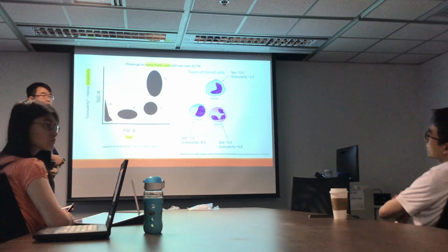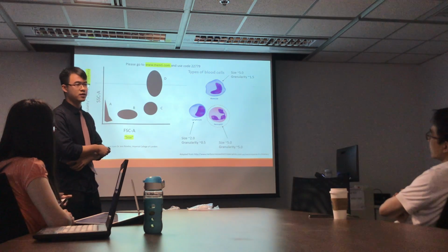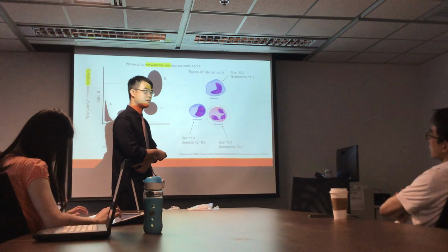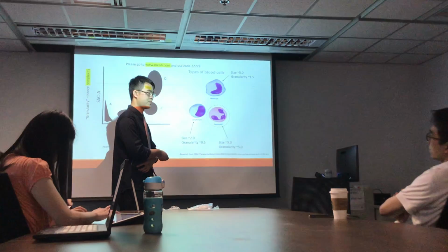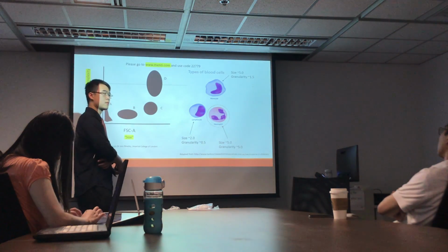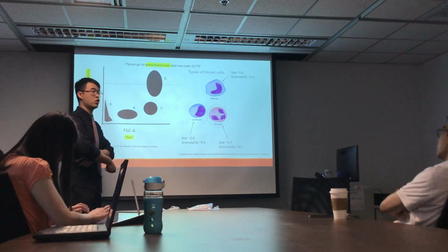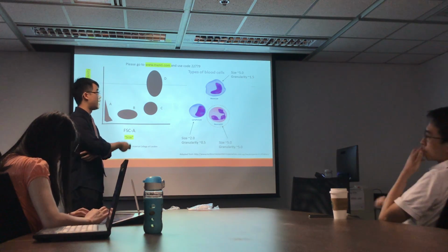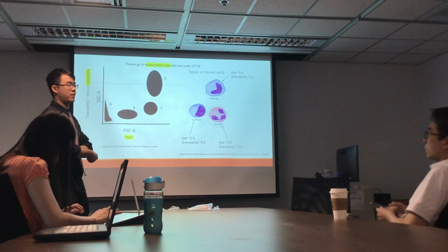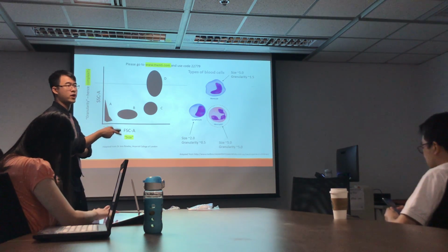Just in the meantime, large cells and small cells flow at the same rate, right? Yes, because you control the pressure of the flowing stream. It depends on how quickly you take them up. You can actually control the pressure, and they have the sheath fluid that I was talking about just now. They have a technique called hydrodynamic focusing that ensures the cells pass through in a single-cell manner.